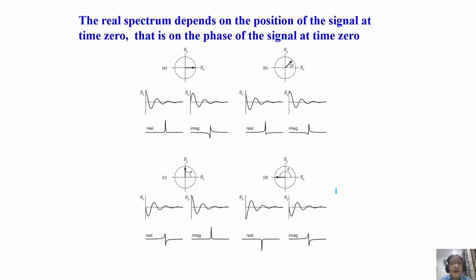Now, you know why the phase error comes. I will not go into this in detail because we discussed this earlier also. If my signal detector is along the S-axis, I told you we have a real part which is absorptive and an imaginary part which is dispersive. Both of them are exactly out of phase by 90 degrees. If so, you collect a very real absorptive spectrum without any phase error. The angle difference between the cosine and the sine part must be exactly 90 degrees.